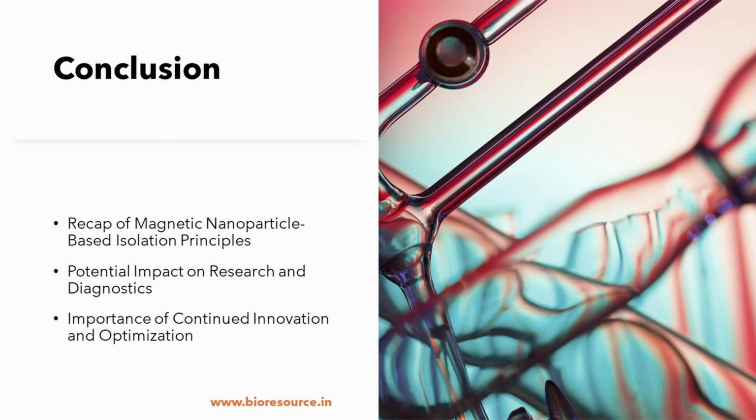So continued improvements, innovation and optimization of the process and the workflow can further enhance the user friendliness and cost effectiveness of this technique, whereby we can have very high quality nucleic acid isolated with improved efficiency, faster methods, and very versatile, and that can be suitable for point of care application with advanced automation condition for handling much larger sample types.